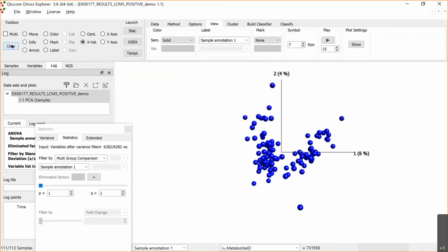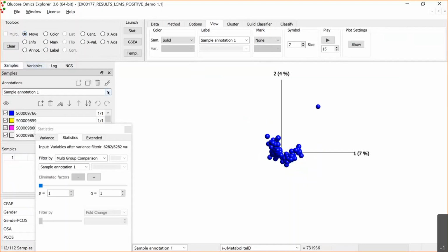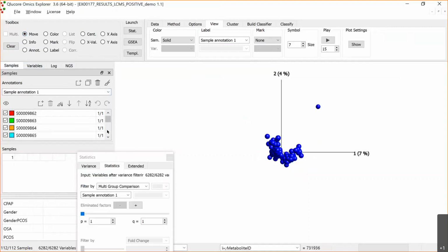So let's clear that again, because this is just diagnostic. I should not continue with that active. So instead I go over here and find this sample. 9915.